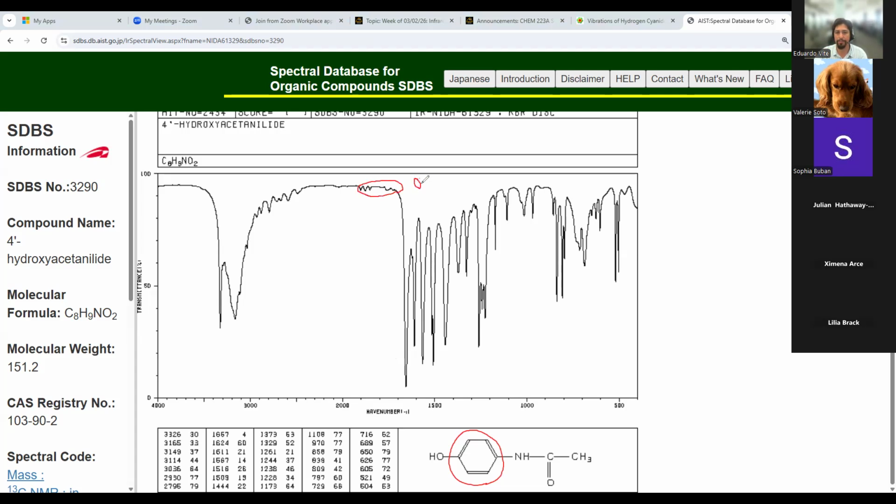That is the proper term. Overtones. These overtones are usually the result of that aromatic ring. So if you see the overtones and the whole spectra looks a little sharp and your structure shows an aromatic ring, you can definitely say, yeah, this is for sure aromatic.